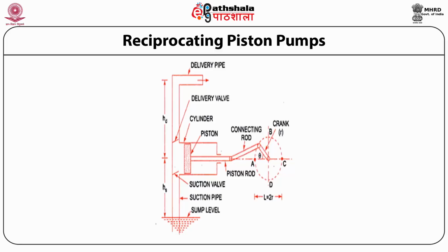Flow rates can be fixed by adjusting the piston displacement. These pumps are advantageous because their solvent delivery is smooth, constant flow rate can be achieved even at high pressure, and supports gradient operation. There is no limitation of reservoir size or operating time. In case of minor pressure pulses, dampening may be required.